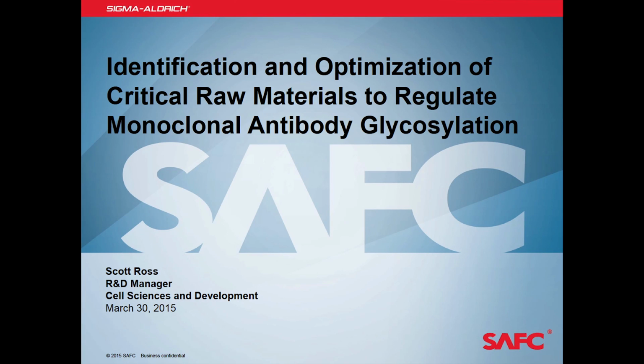So my title of my talk today is Identification and Optimization of Critical Raw Materials to Regulate Monoclonal Antibody Glycosylation. What I'm going to do today is explain to you our techniques and our systems and strategy and how we go about regulating glycosylation. And then I'll do a case study at the end with a client that we did some work on, and then hopefully explain all these things in good detail so you understand what we can do and offer for the corporation.